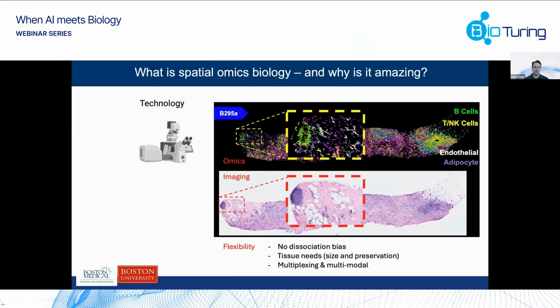Compared to, for example, single cell, there's no dissociation bias, or there's very little. There's another bias, maybe spatial bias, but there's no dissociation bias. And that matters, for example, if we're interested in understanding the role of adipocytes, which are these holes you see here, these big blobs. These are adipocytes. You'd almost never find them in single-cell RNA-seq data sets, or very rarely, but they have a really important role in shaping some of the tumor microenvironments that we know.